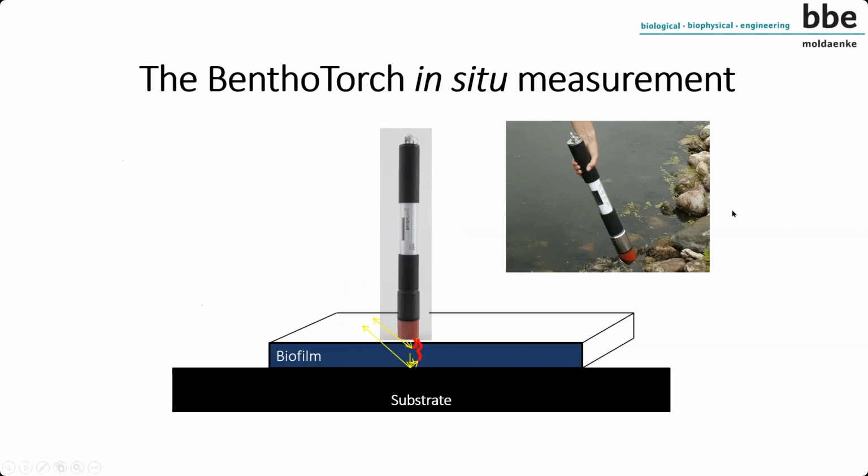You see that here we have a red cover, but nowadays it is a black cover, which shields the measurement against ambient light from the sun, for example. It's important to take care of this. That is very easily done, and then after a short time, let's say after half a minute, you can read the results directly on the integrated display.